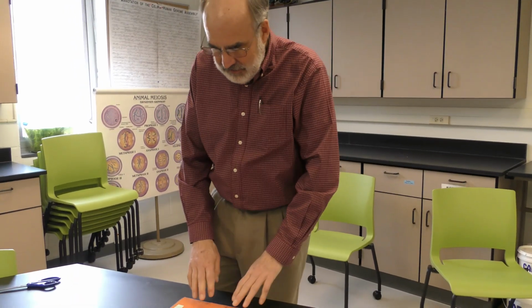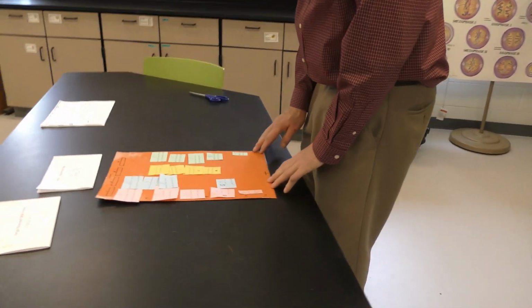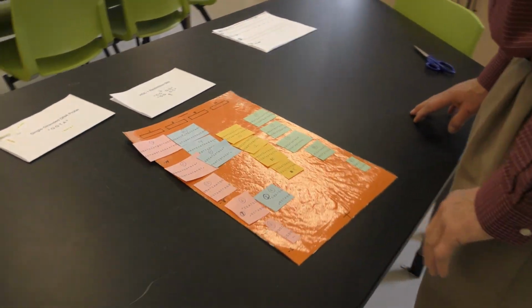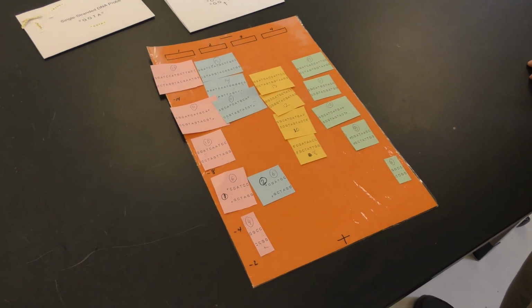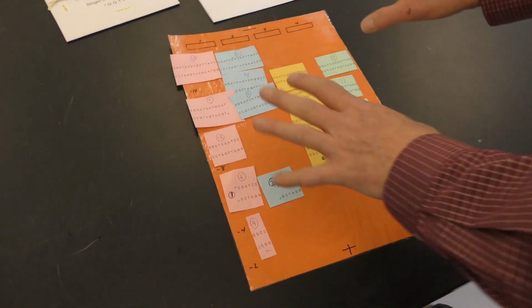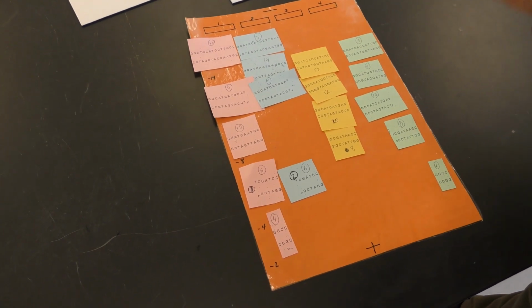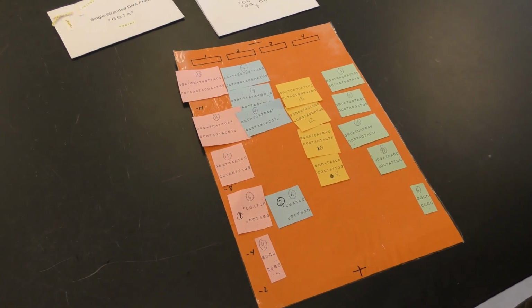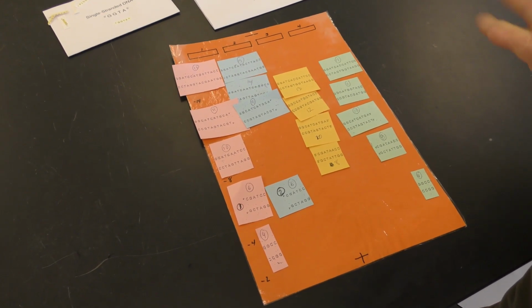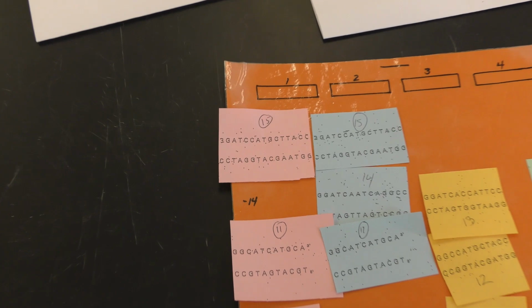I went ahead and generated all the fragments from those 4 DNAs, and I arranged them onto the hypothetical gel box. And what I did, you might want to do this at home when you do this, because I'm working with colored DNA, so I know which DNA it is. You might want to specifically, for every fragment you generate, put whether it came from DNA 1 or DNA 2, so you don't get confused when you generate your fragments. Also, it's nice that I've counted up the number of base pairs in every fragment and wrote that onto the fragment, so it's easier to arrange them on your gel box.